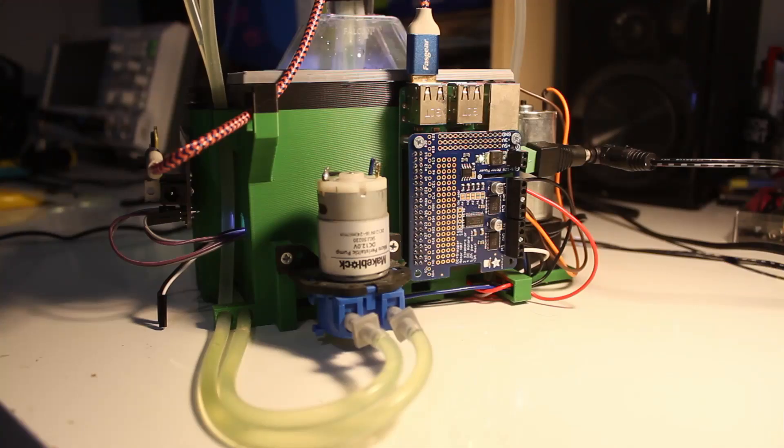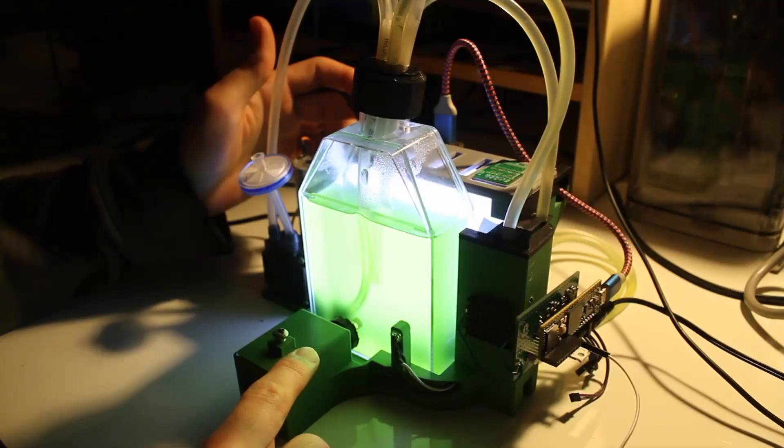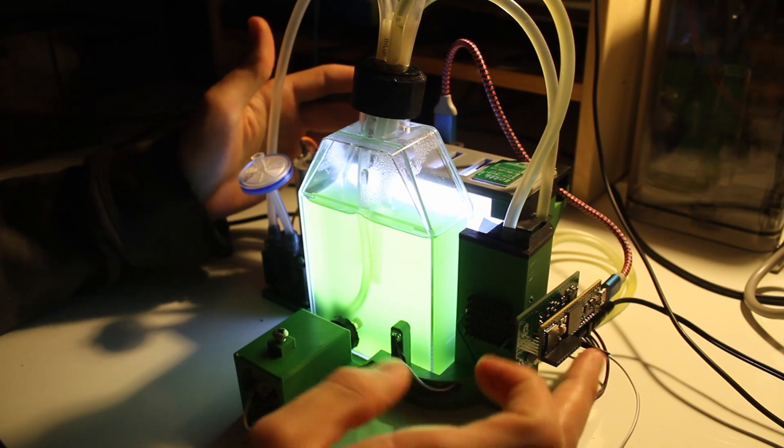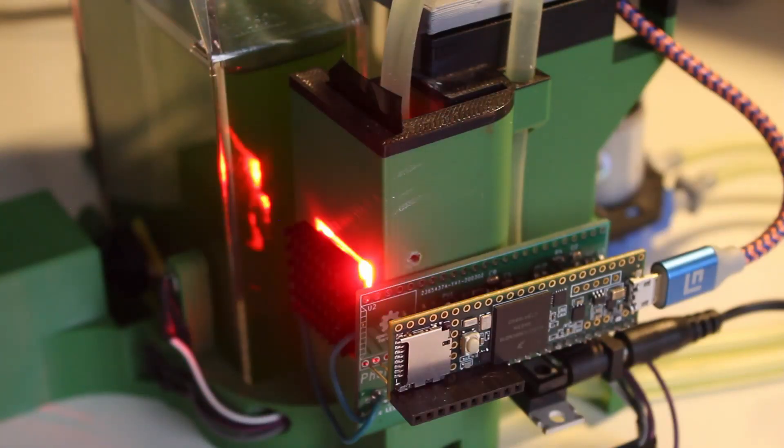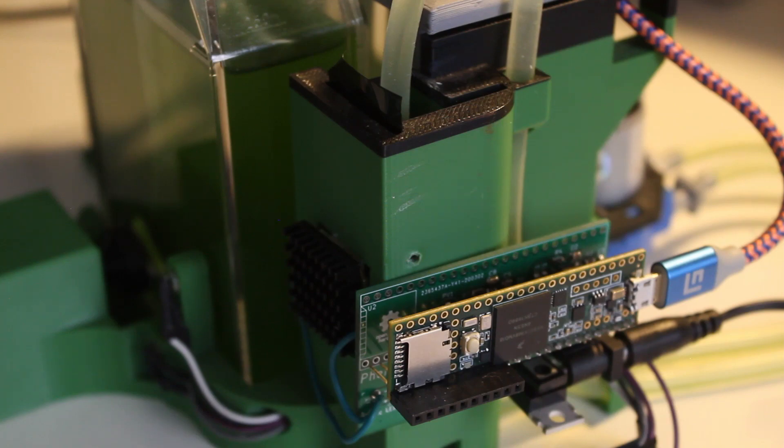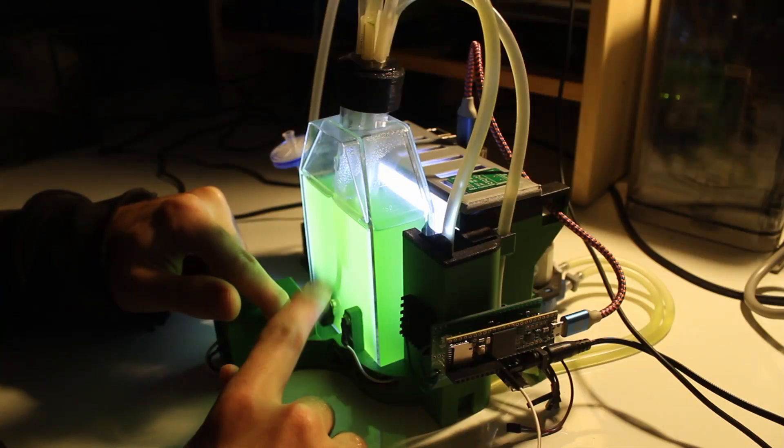It consists of a Raspberry Pi computer located on the back of the 3D printed housing. This is connected to a microcontroller on the right hand side here, which is running a chlorophyll fluorometer for measuring photosynthesis in the microalgae.